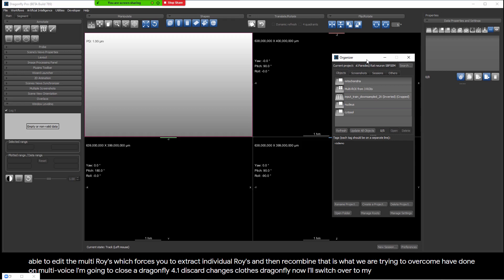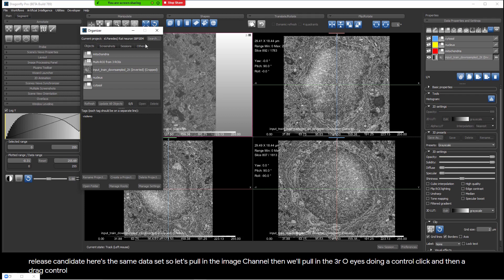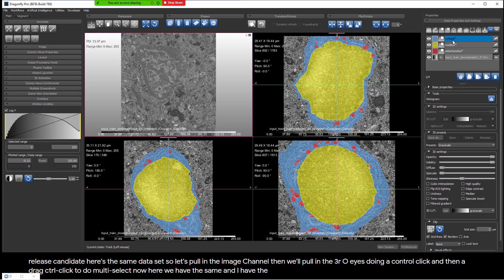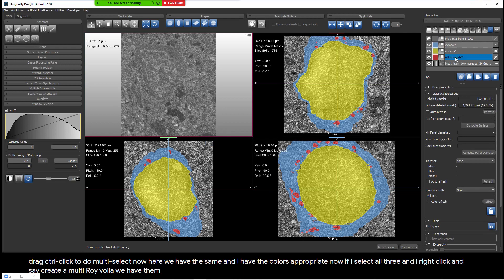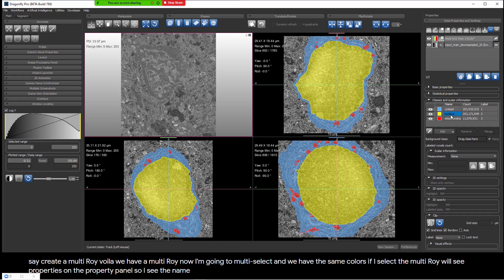Now I'll switch over to my 2020.1 Release Candidate. Here's the same data set. Let's pull in the image channel and the three ROIs using Control-click to do multi-select. Here we have the same data and the colors are appropriate. If I select all three and right-click and say create a MultiROI — voilà, we have a MultiROI. I'll multi-select and delete the individual ROIs, turn on the visibility of the MultiROI, and we have the same colors. If I select the MultiROI, we'll see properties on the property panel showing the names and colors of each MultiROI label.